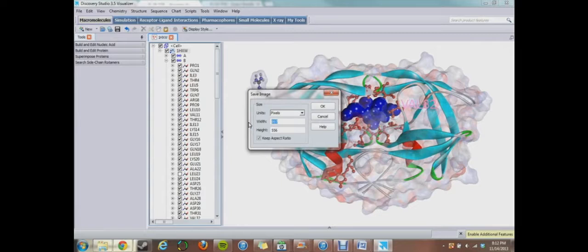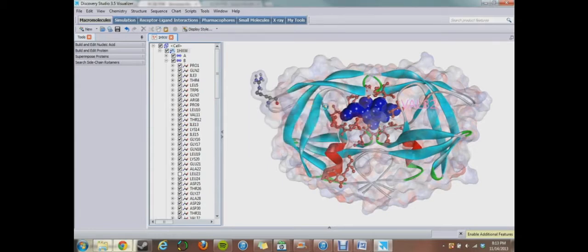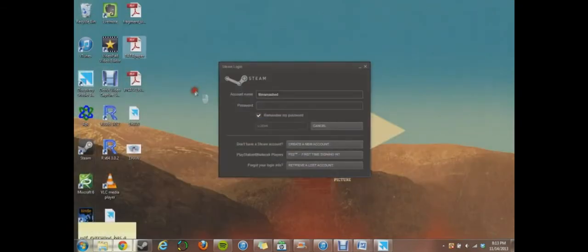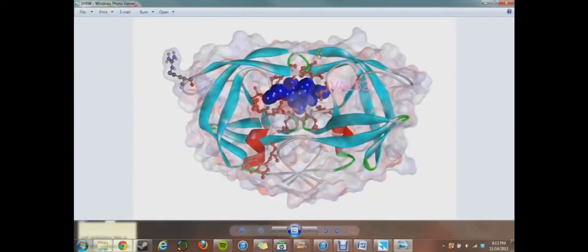I'm not sure which one. It won't matter. You're going to get a high resolution image, but I'm pretty sure it says in Malachi's directions. You can look. You want to change that to 2000, and don't worry about the other box. That will change automatically. If you watch for a second while I hit OK, that changed. It changed to 1240. So I hit OK. If I go to my desktop, I should be able to see it. Yep, it's right here. And I have a nice image.